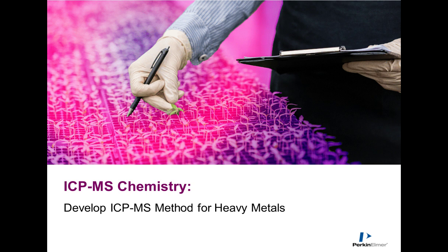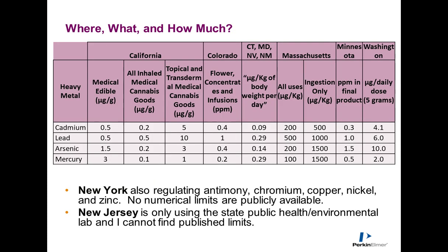Moving from the volatiles now, we can talk about heavy metal analysis in cannabis and hemp. Heavy metals are important, and we know that food and pharma testing of heavy metals is a daily affair, and with a lot of cannabis and hemp products ending up in similar product types, understanding heavy metals or the lack of, hopefully, is important.